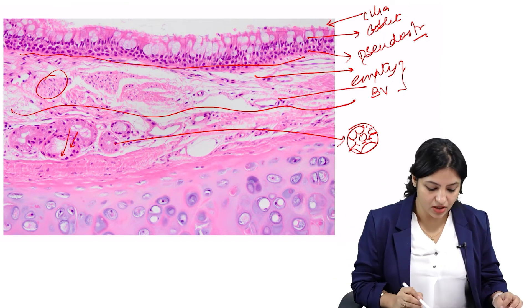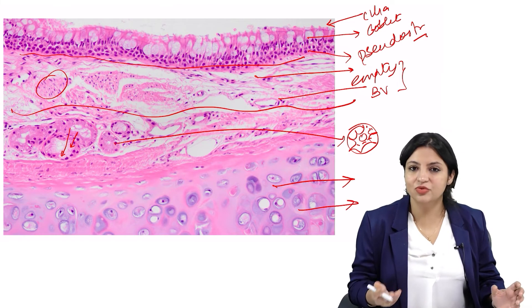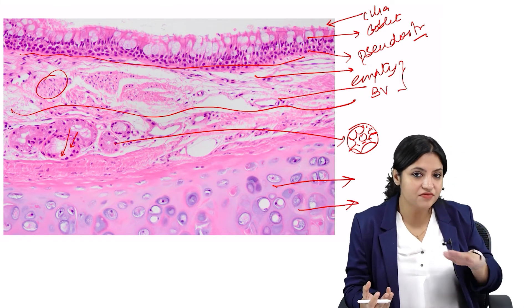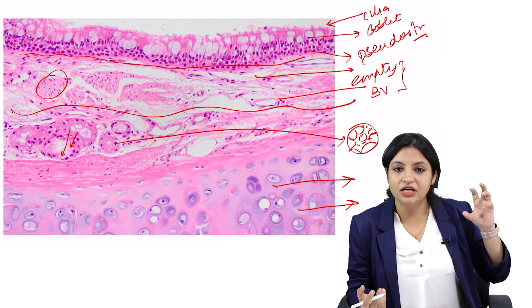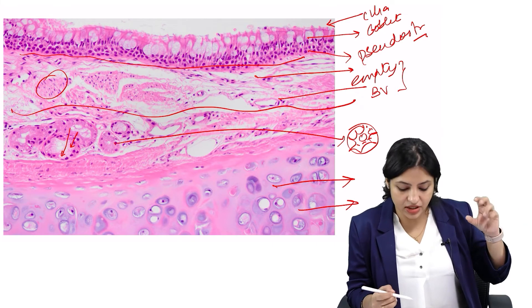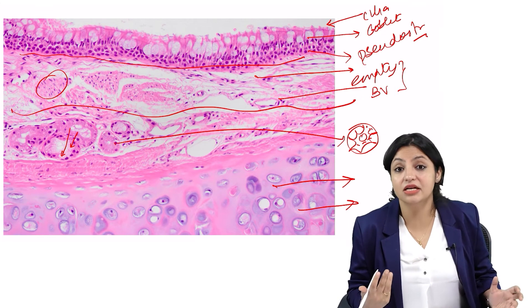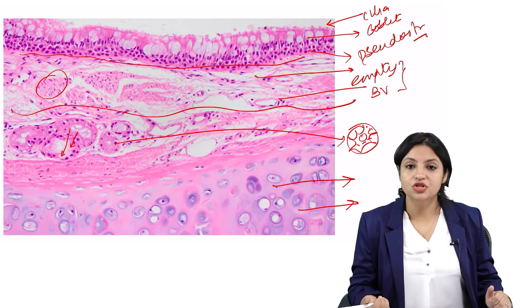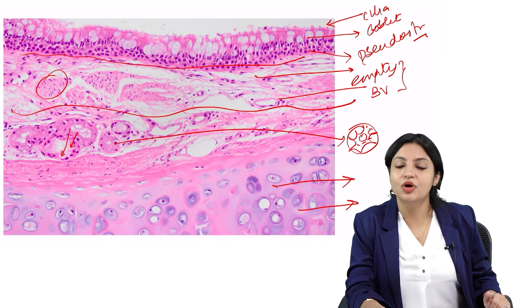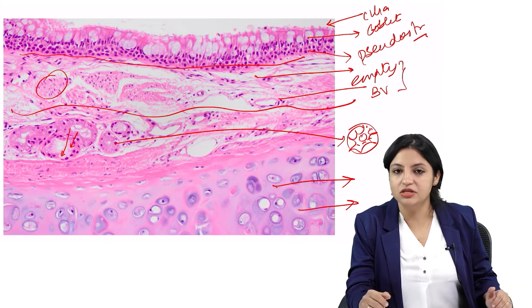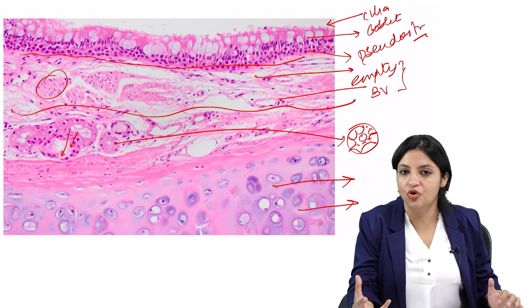Now let's come to the next part. There is a base with a very clear blue homogeneous layer with lacunae containing some cells — this is hyaline cartilage. Once you see cartilage, you can say this is probably a bronchus — a normal bronchus, because here there is no pathology involved.